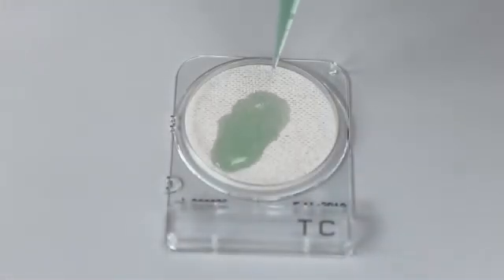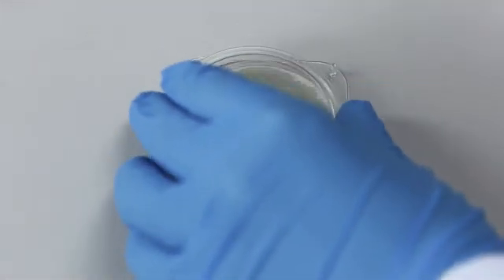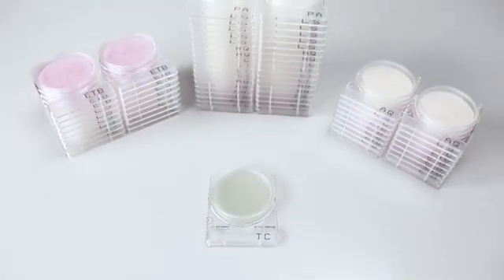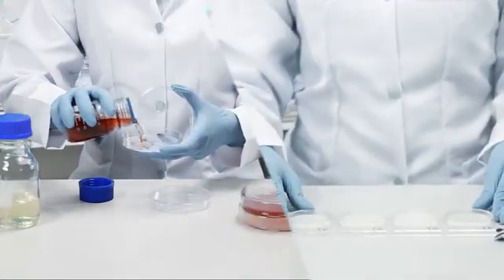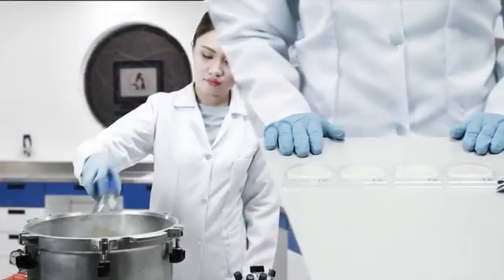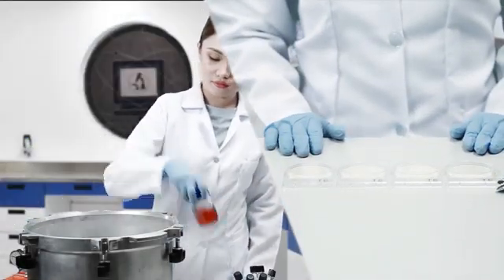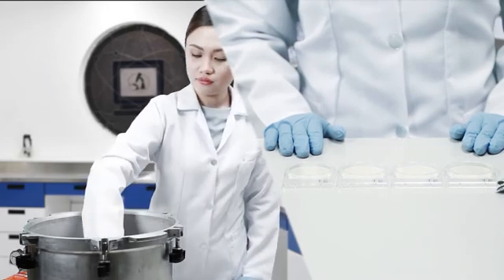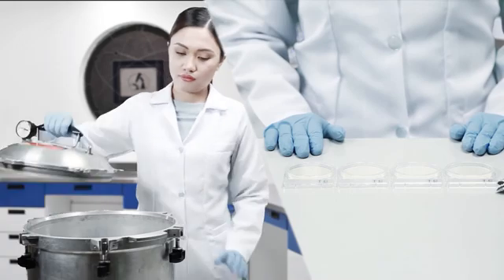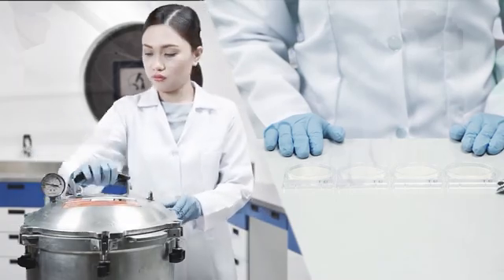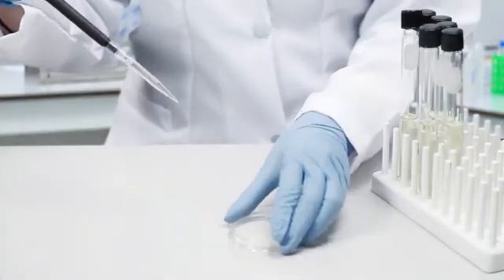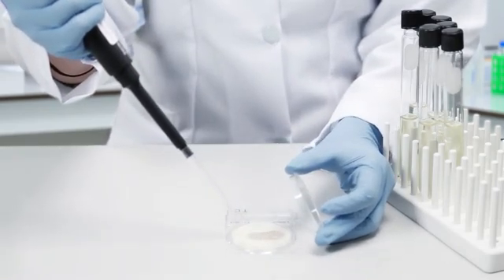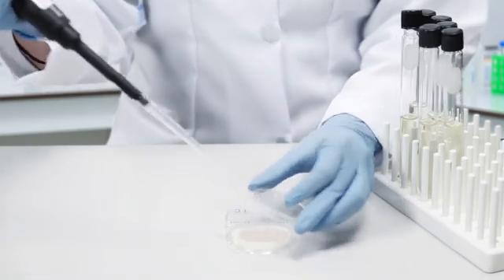With these components and features, Compact Dry brings your microbiological detection to greater plates. No need for sterilization, saves time, water, and energy, avoids contamination pre and post-inoculation. Each plate of Compact Dry contains a self-diffusing fabric medium which eliminates the need for pressing, spreading, and tilting of plates before incubation.